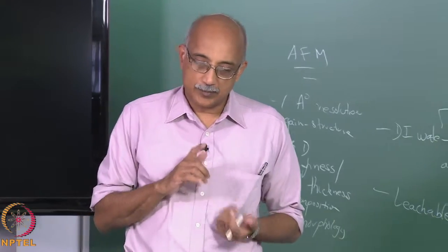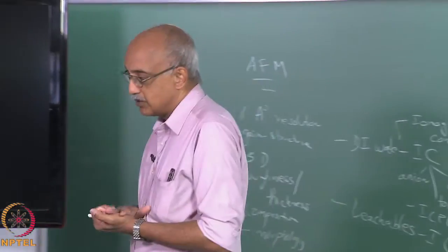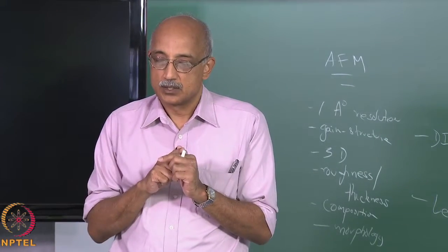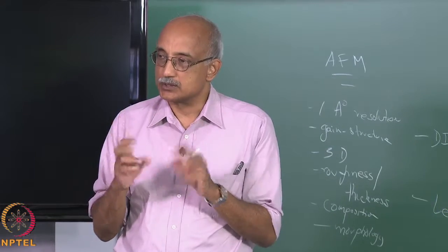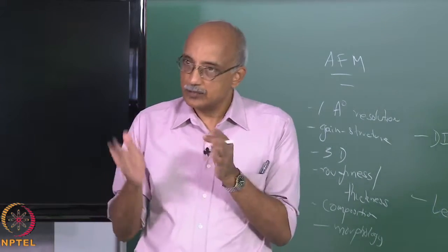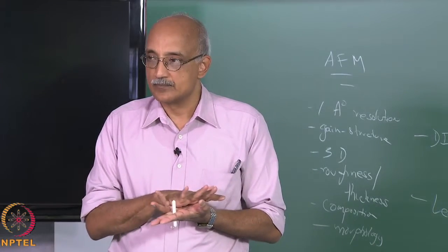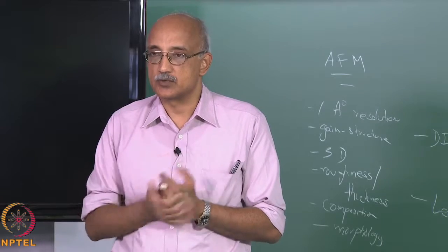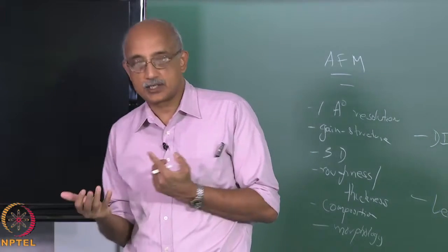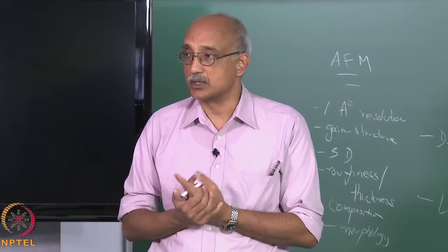AFM, by the way, can be operated in what's called a contact mode as well as a non-contact mode. When you look at the interaction between a surface and another surface, there are actually two kinds of forces. There's an attractive force and there's a repulsive force. And in fact, the equilibrium position that the two surfaces will ultimately occupy is based on a balance between these forces. So, the van der Waals force is essentially an attractive force, but there are repulsive forces as well.